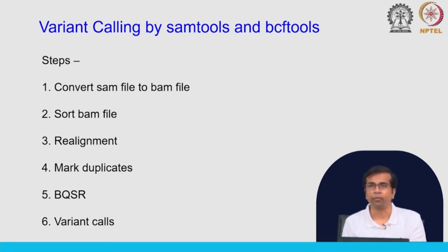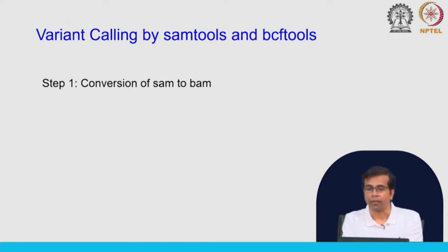Okay. So, one of the things you should notice is that when we install SAM tools, etc., you might end up with some issues with some libraries. Okay. So, you would have to install them independently. Okay. For installing SAM tools and BCF tools, you have to again rely on the install commands that are there. So, I can go and show you these install files that actually mention the step by step installation process. Okay. So, I will show that, and then we will start with the conversion of SAM to BAM.